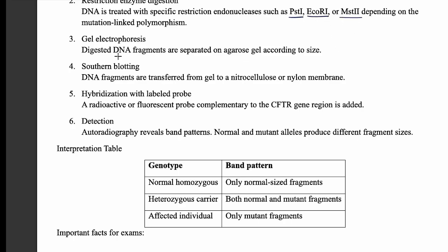After that, we just analyze these DNA fragments on gel electrophoresis, and we detect whether the mutation was present or not. Now supposedly, as compared to a normal sequence, suppose these kinds of fragments are produced, and these are exactly equal fragments produced, suppose like this way. So now we say that the person is a normal person, neither a carrier nor infected with that particular disease.